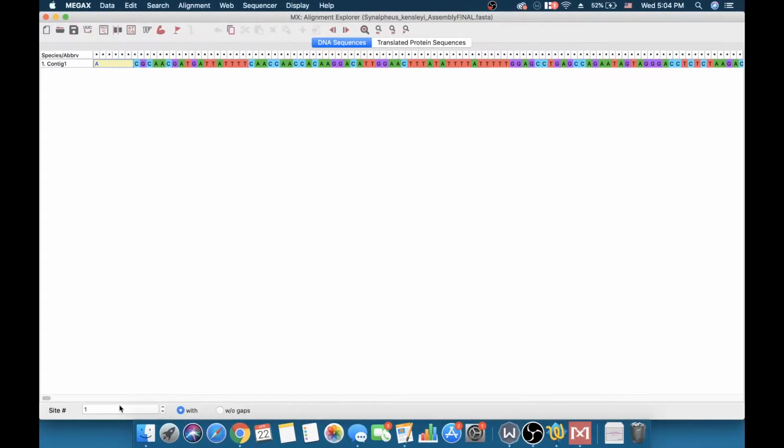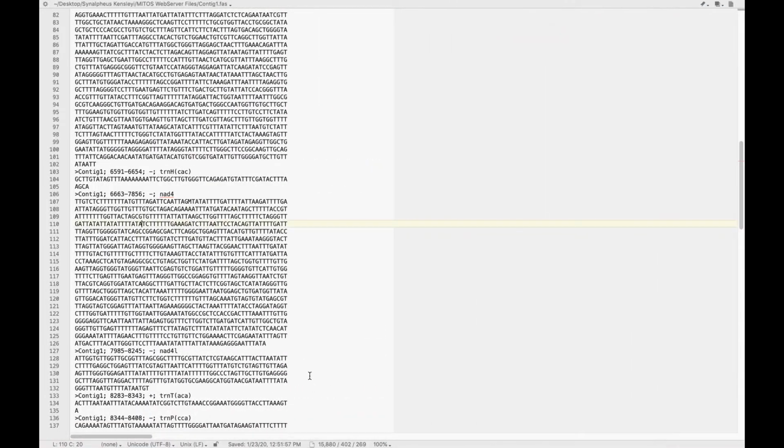That Text Wrangler says our gene is at. Now since this gene is on the negative strand, it's actually going to be read from right to left, meaning that this TAT here is the end of our gene. I like to look for start codons first because that's going to determine our reading frame. So we're actually going to head to 7856.